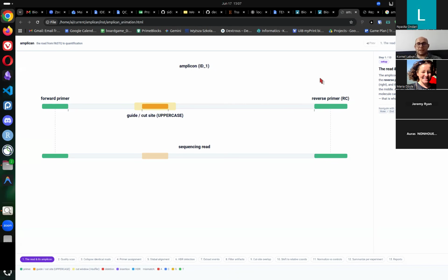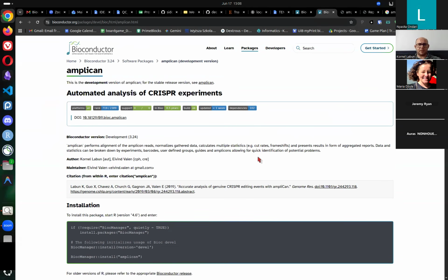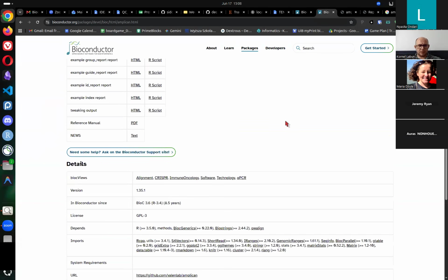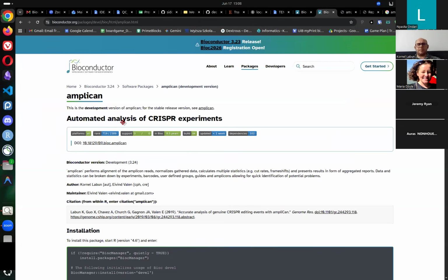I prepared a couple of extra resources, because I figured this is an opportunity to go back to ampliCan, which was published many years ago, I think around 8 years ago. This is the ampliCan website on Bioconductor. There should be somewhere visible how many years it's been available. I also prepared an outline of what we will be talking about.